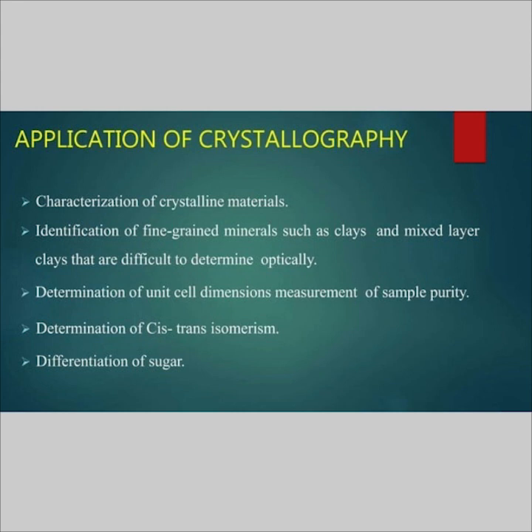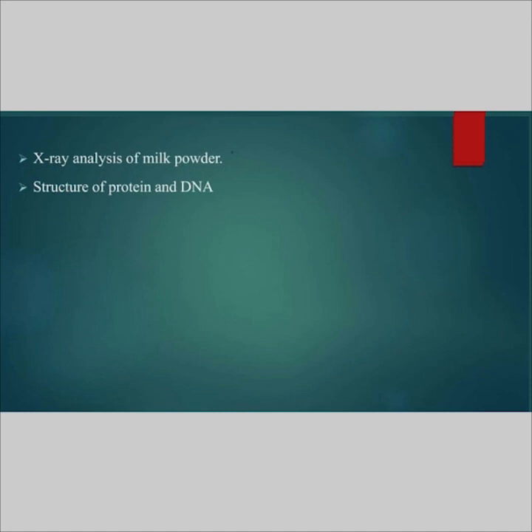It also determines unit cell dimensions and measures sample purity. It determines cis-trans isomerism. It differentiates sugar. It is used for X-ray analysis of milk powder, and it is also used for the determination of the structure of protein and DNA.